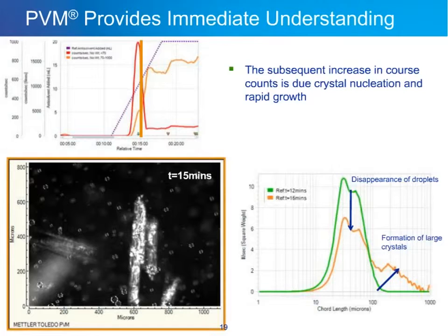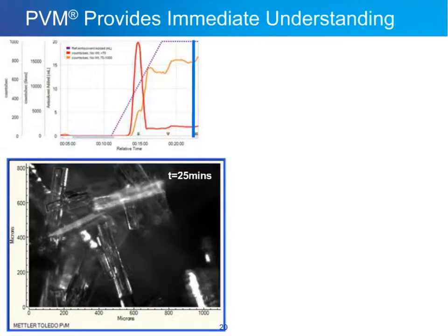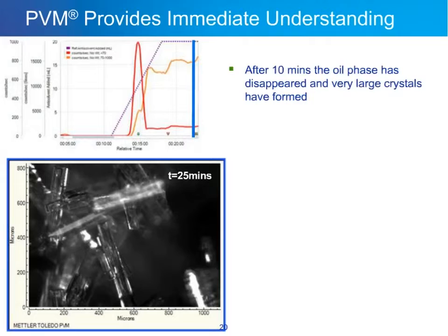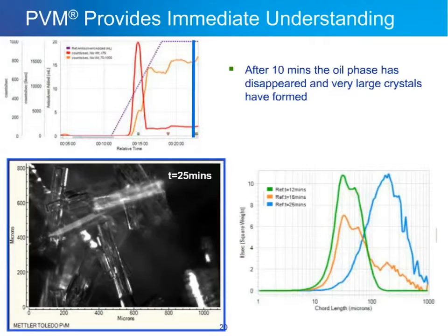This correlates with the FBRM data: a decrease in the distribution around 40 microns as the oil phase disappears, and an increase above 100 microns as crystals form. By the end of the crystallization at about 25 minutes, only large crystals remain with no oil phase present. The FBRM distribution shows the oil phase completely gone and significant crystal growth. PVM also shows significant agglomeration, probably due to the high supersaturation that caused the oiling out.